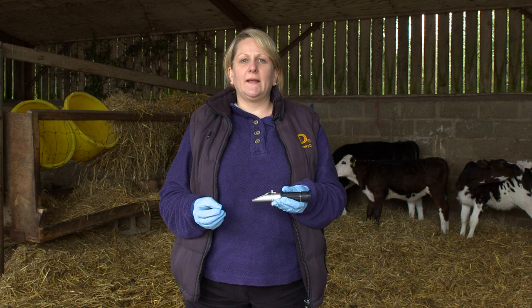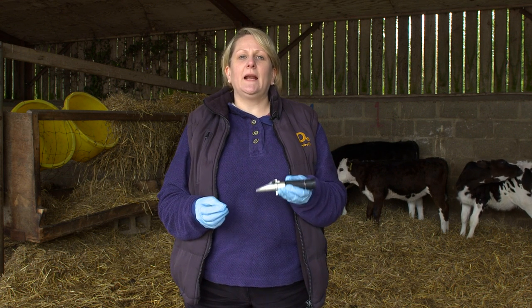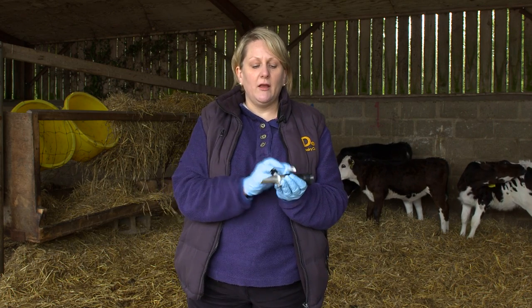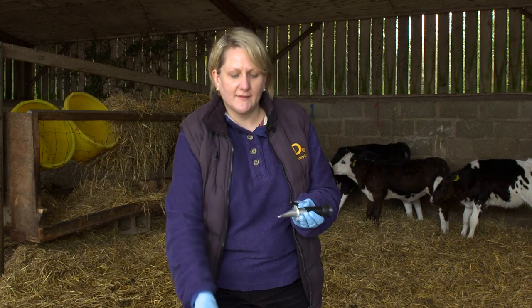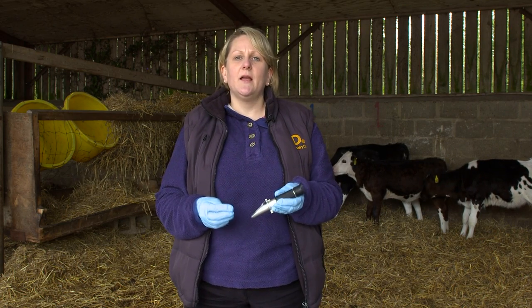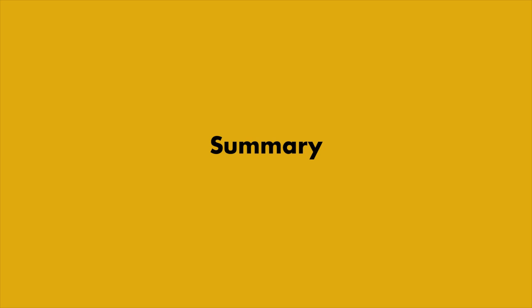Once you're happy with the reading, the refractometer should be cleaned scrupulously, cleaning both the glass surface and the cover to avoid contamination of the next sample. Do not immerse the refractometer in water, as this will damage it.